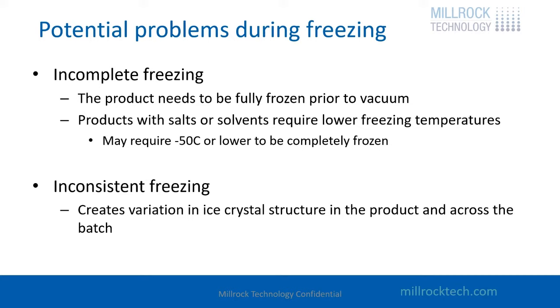So it's highly recommended that you freeze in the freeze dryer when you can, and it's done at a controlled rate so you get consistent ice crystal structures across your batch.